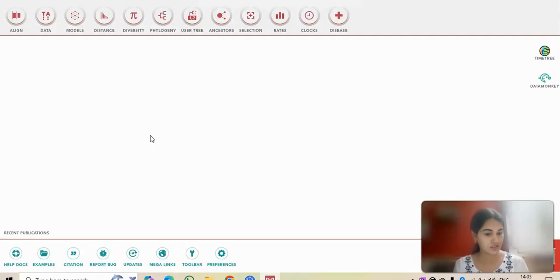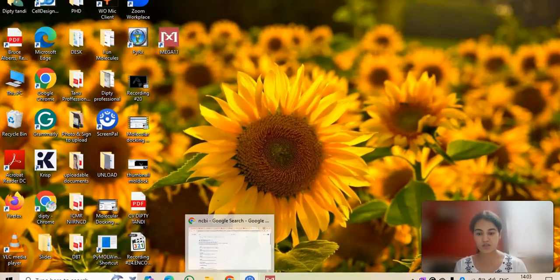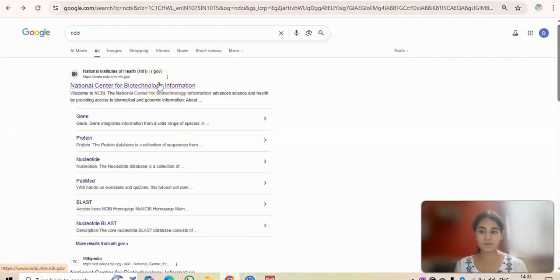How do they construct this? How do they collect these data? So you are going to be part of this by using this simple tool, and let's get some sequences, for example, and construct our own phylogenetic tree and learn the evolutionary relationships in species a little better.